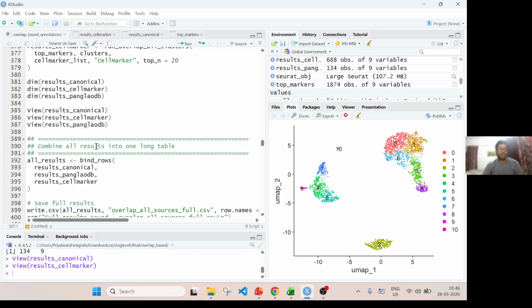First of all, don't worry about this code, because there are automated tools available, which we will see. But I wanted to show you how those tools work behind the scenes. They take this, they do that, and they calculate all these statistics.